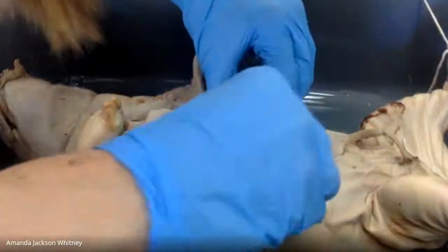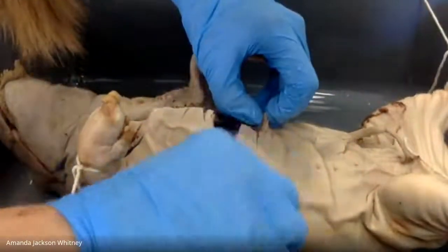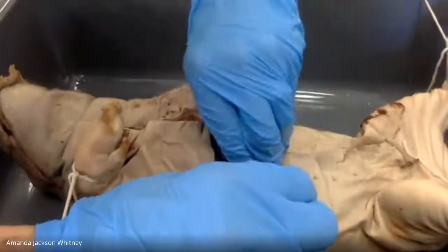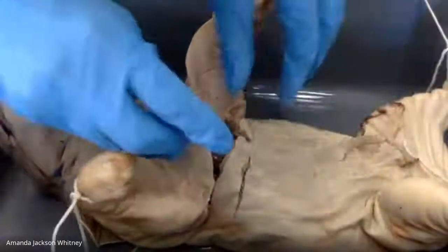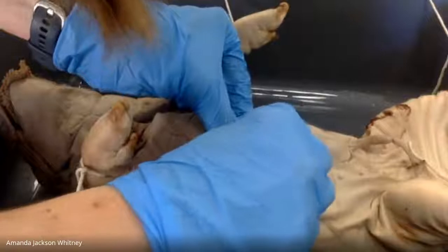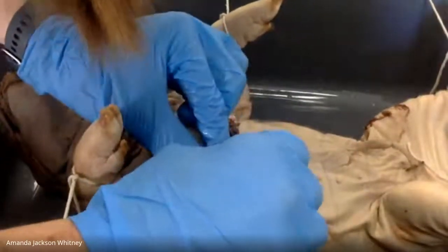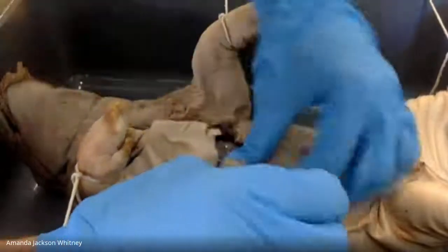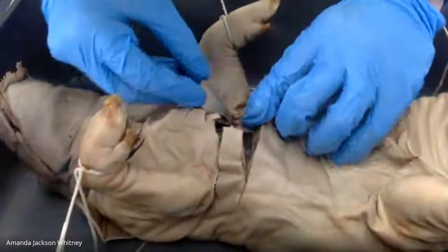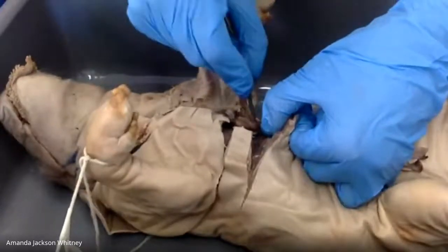What does cardio mean? Anyone? Sorry, did you ask what cardio means? Yes. Oh, heart, right? Yeah, exactly. Cardio is heart.